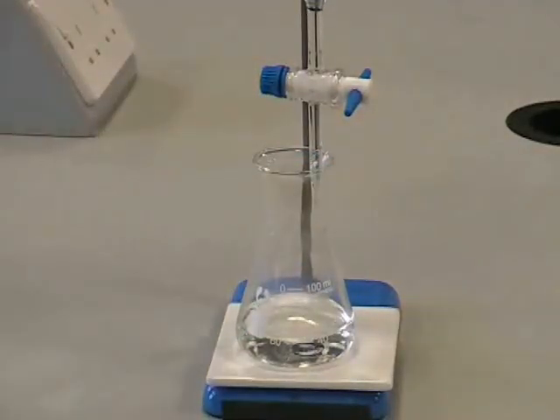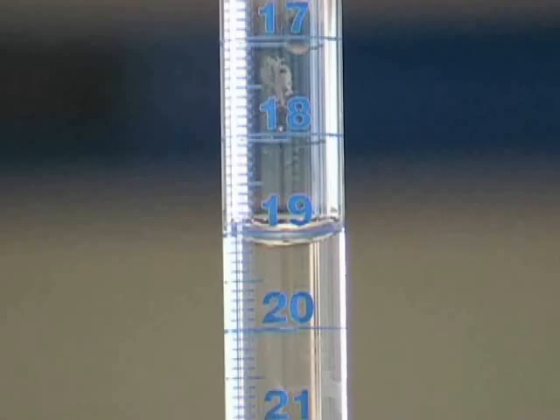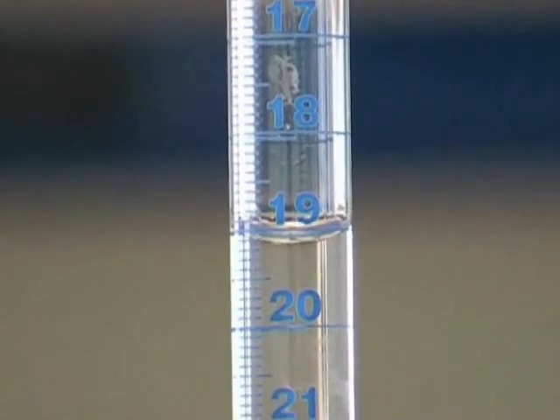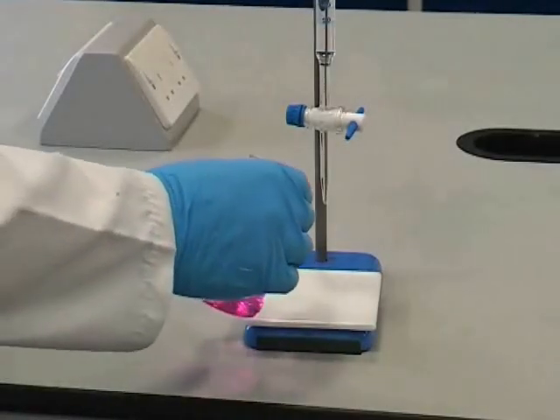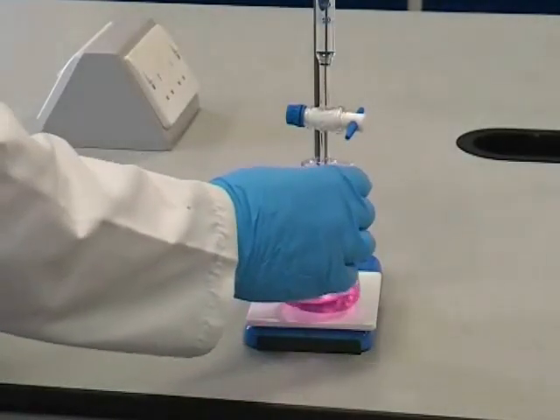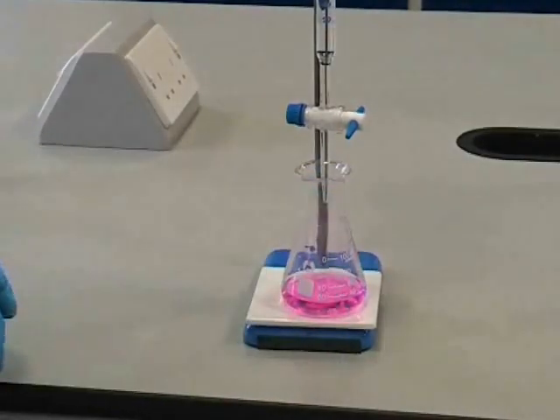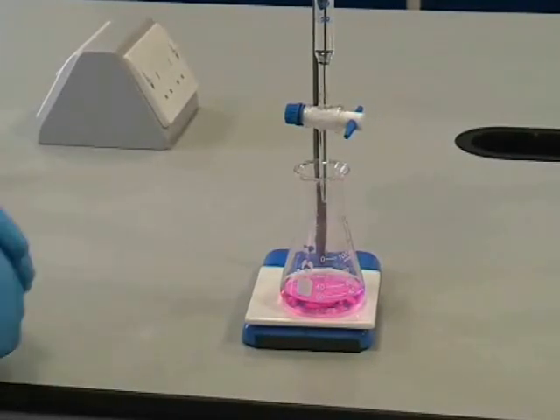We can now work out the volume of solution which we added from the burette by noting the final burette reading and performing a simple subtraction. In this case we've added just over 16cm³ altogether so we can reasonably expect our accurate titrations to require somewhere in the region of 15cm³ of solution.